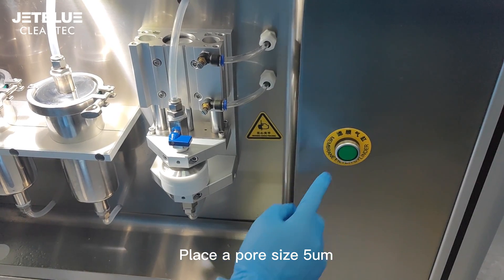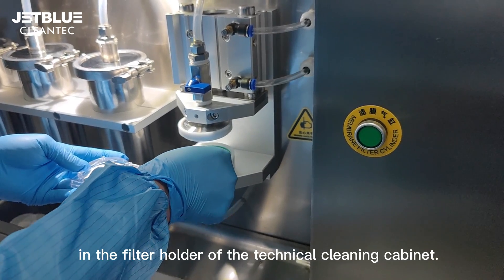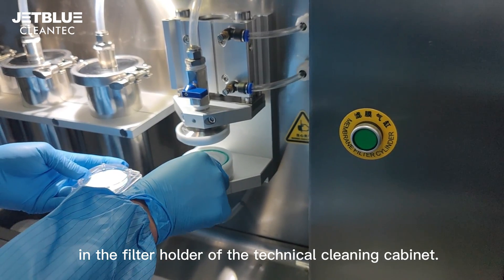Place a pore size 5 µm diameter 47 mm filter membrane in the filter holder of the technical cleaning cabinet.